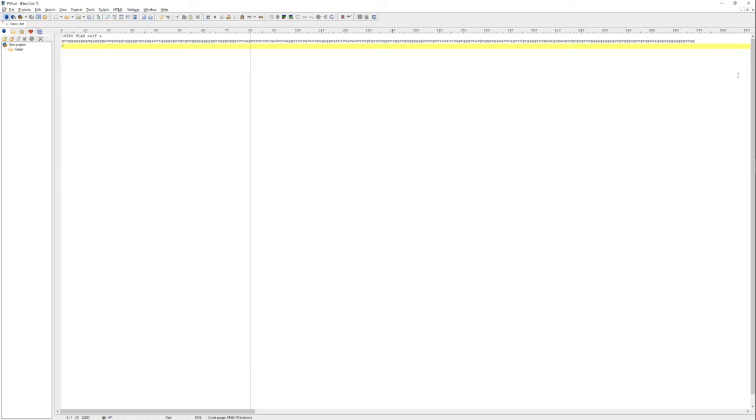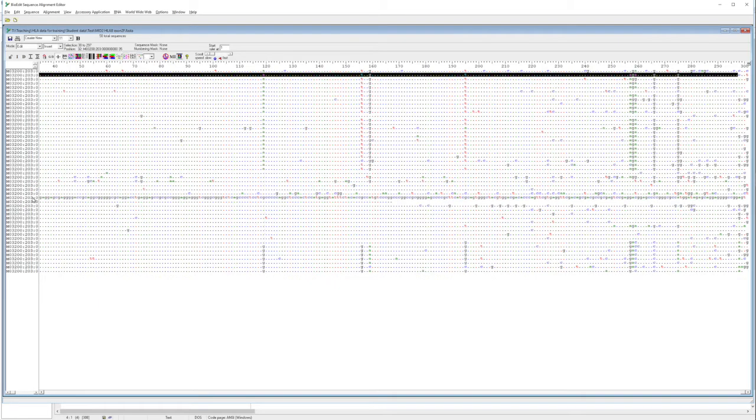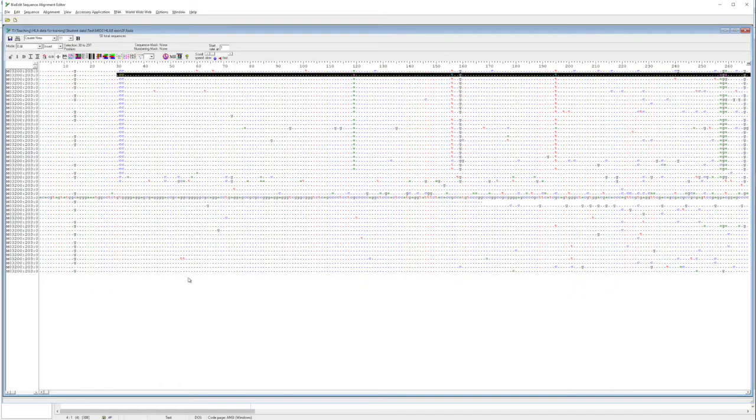And then we would do the same for mid2, HLA-B, exon 2, forward, and we'll just denote the second one as being B. So we'll go back and we just choose one of these ones, and randomly I've managed to choose one that doesn't seem to have any sequencing errors.